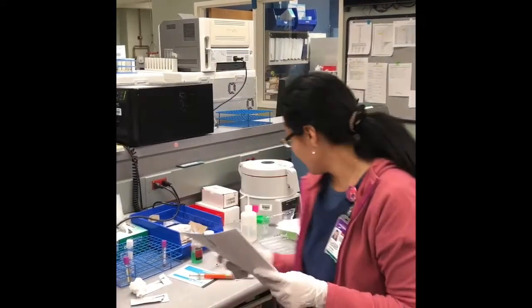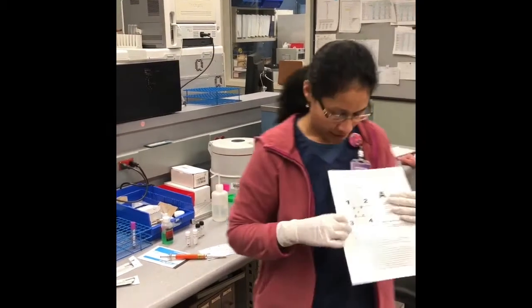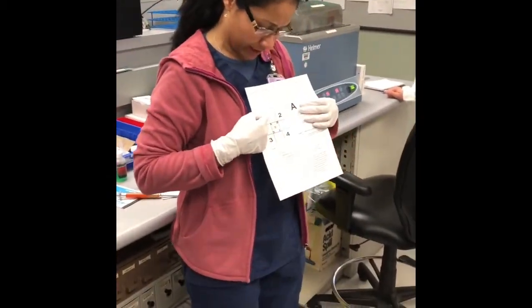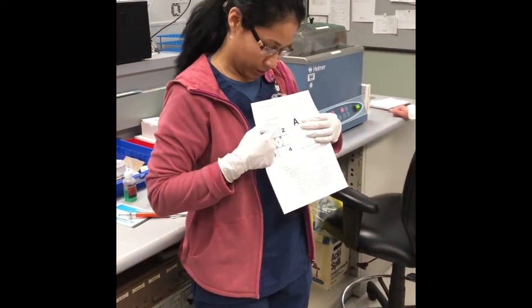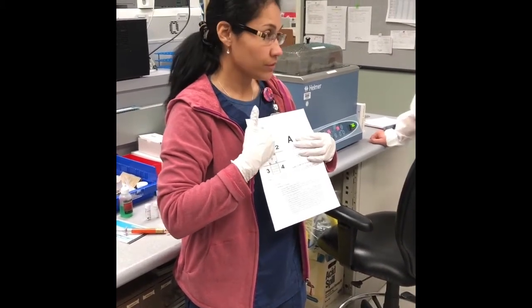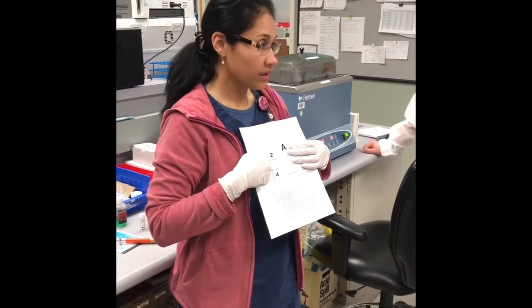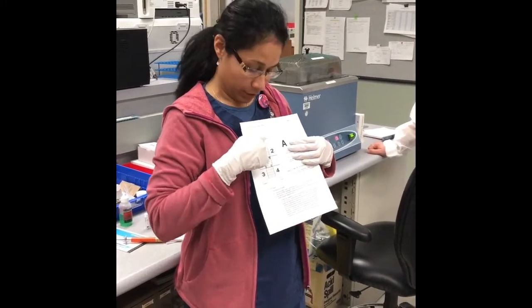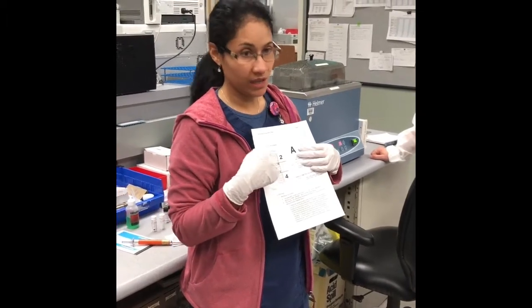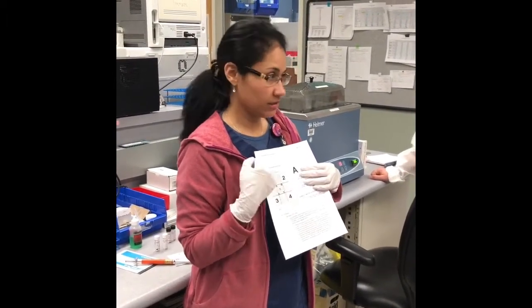But a lot of my kids have the question all the time: if you see a cell that is right here on the outside, I will not count that. You count the ones that are inside, but also you can count the ones that are between the lines. If you find a little cell between here, that will count, but not in the outer side, only in the inner side. Correct. Same with this one.